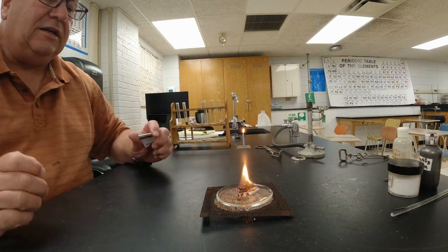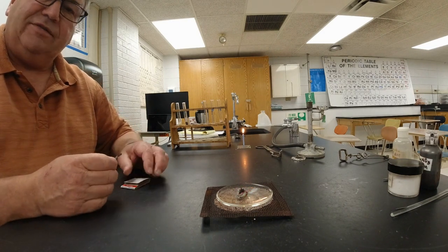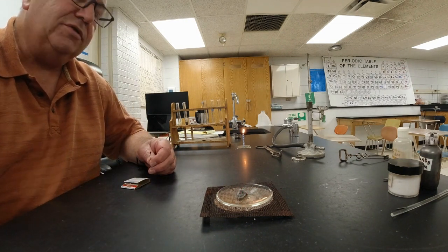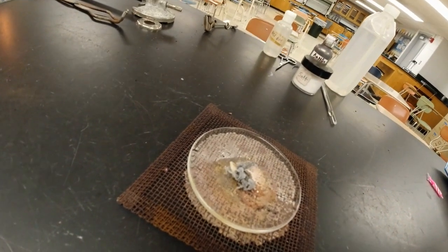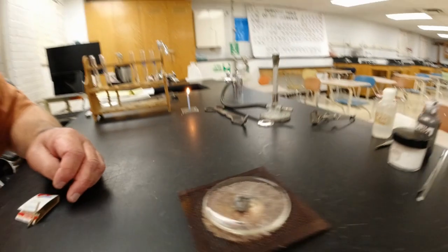You can feel heat coming from it, and the paper towel is disappearing. And what's left is just a bunch of ash. Now there might be a little piece of paper towel that didn't finish burning there, but you mostly get just ash from that. I don't know how well you guys can see that, but there's hardly any paper towel left. All right, if you need to pause and write down some observations, you should do that.